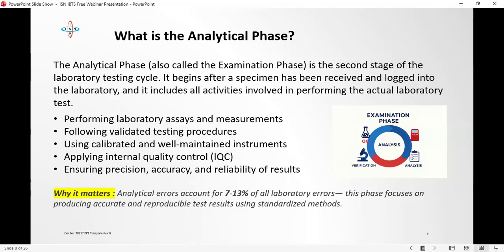So this is where I want to actually talk about precision and accuracy. Those are two very important aspects of this phase. An analyzer can give you very consistent results. When an analyzer produces very consistent results, you can say there is precision in that analysis, right? But if those results are consistently wrong, then you have a problem with accuracy.